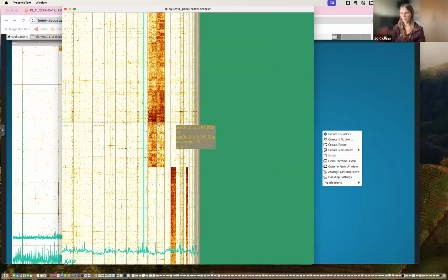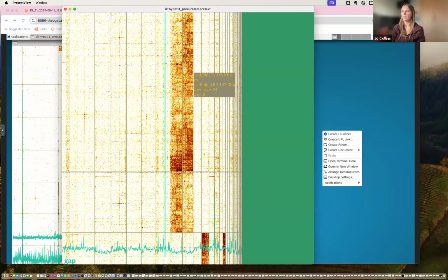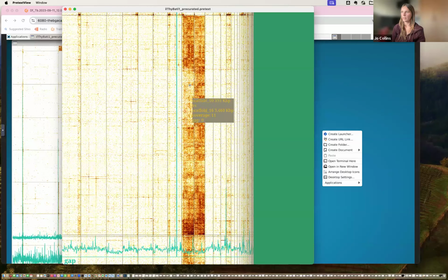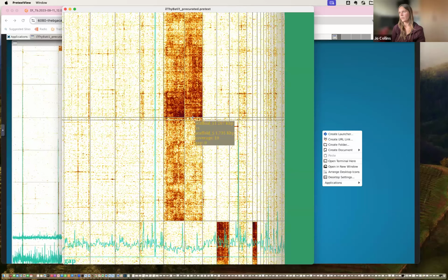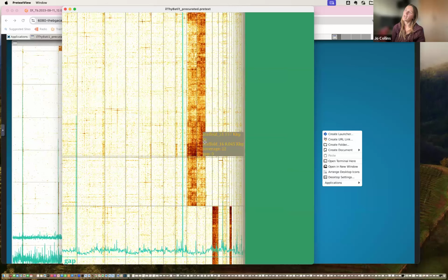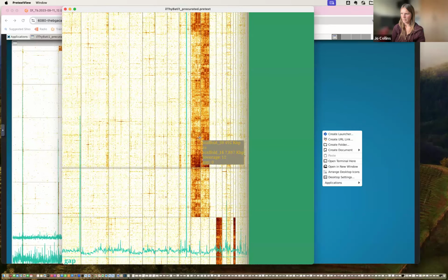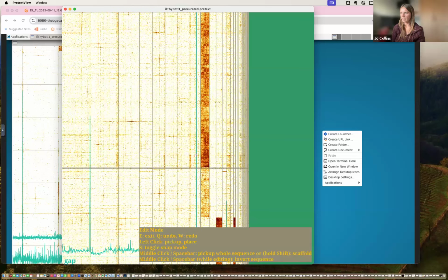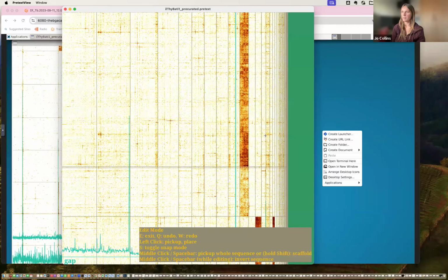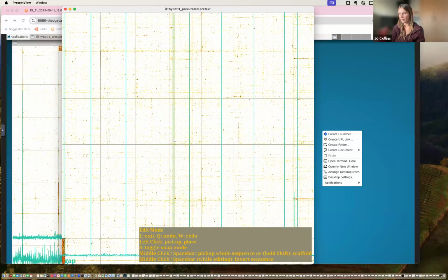Let's come back here. Looking at these already, I can see both of these pieces of scaffold want to join this chromosome, but actually they both want to join in the same location. And looking at their HiC affinity, they have slightly differing contacts. So it's likely that these may be haplotypes of each other. So we could have taken those at once, actually. I'll do that so you can see you can do that.